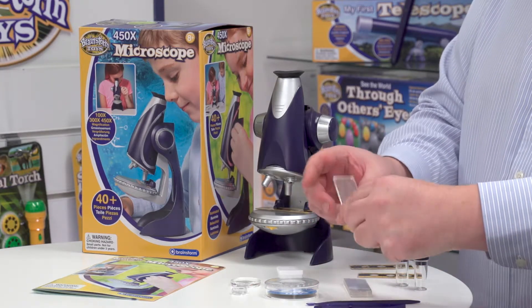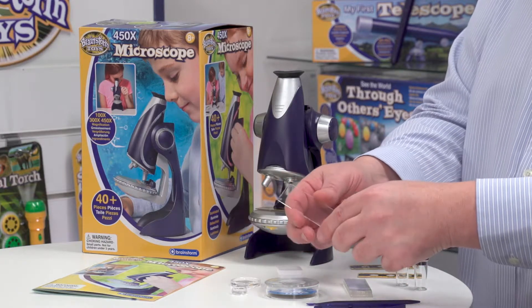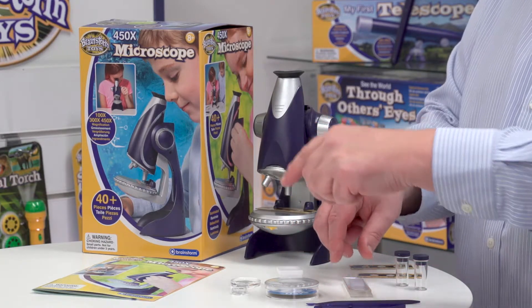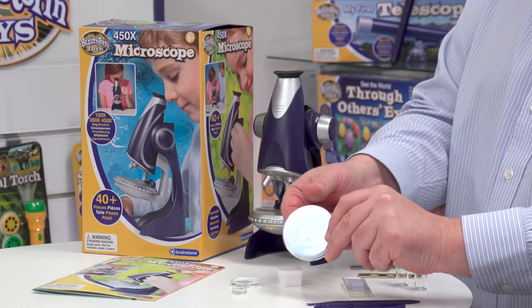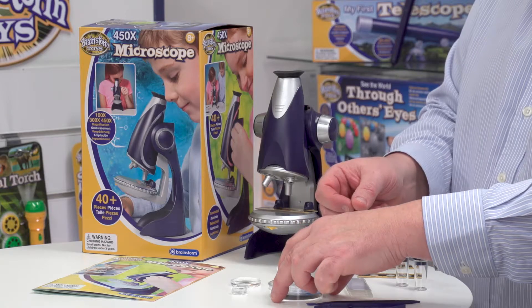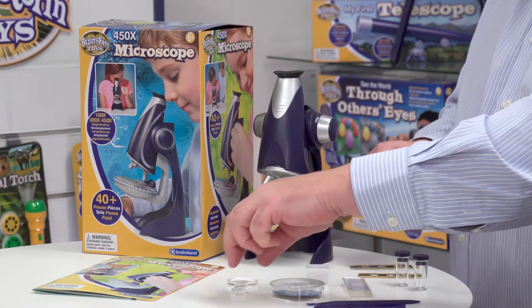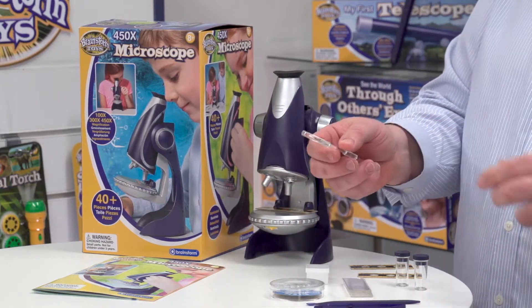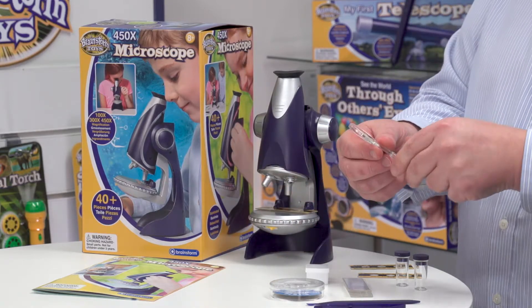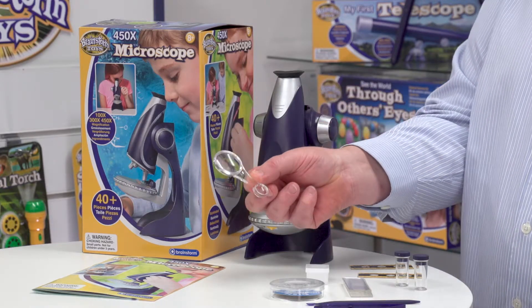We've also got some slides which you can use for making your own samples, and there are instructions in the leaflet about that. We've also got a petri dish where you might grow some samples. We've got some labels for labelling up your samples, and when you're on the go collecting samples it's quite handy to have a little magnifier — we've got three times and six times magnification on that.